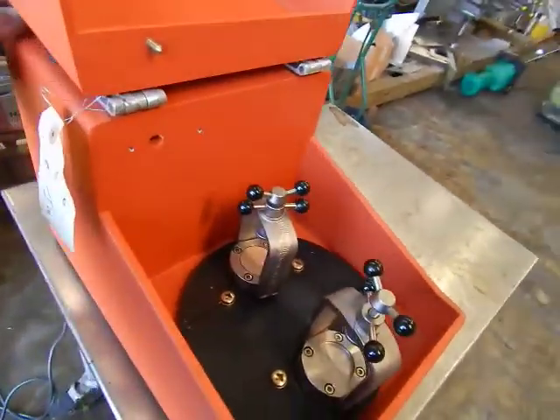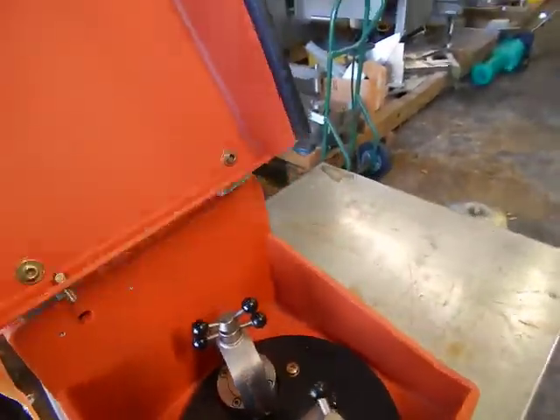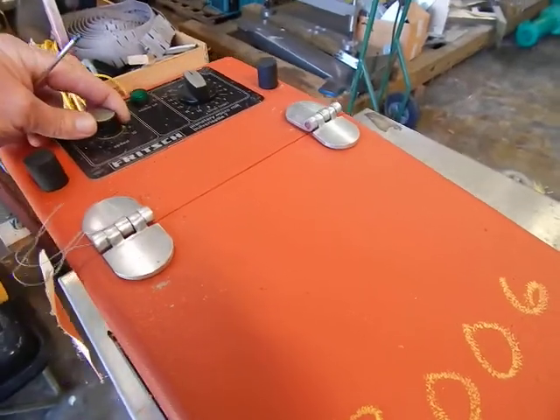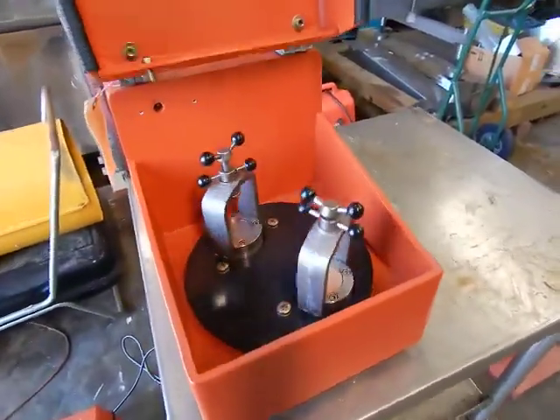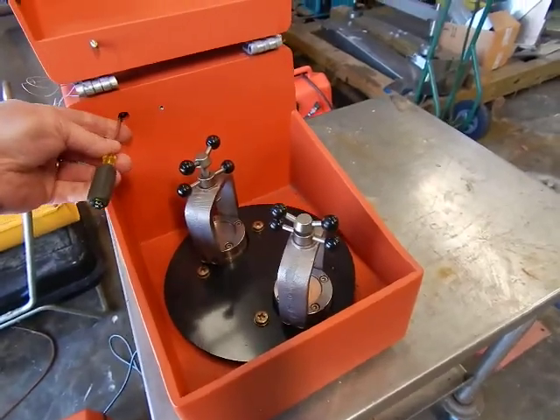We're going to turn the speed up a little bit. Let's close the cover. You'll hear the timer just went off, so we'll turn the timer back on. You'll notice it has a braking device — it almost stops almost instantaneously. Just to show you how much faster that is.